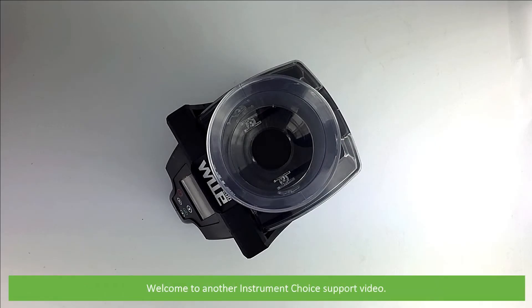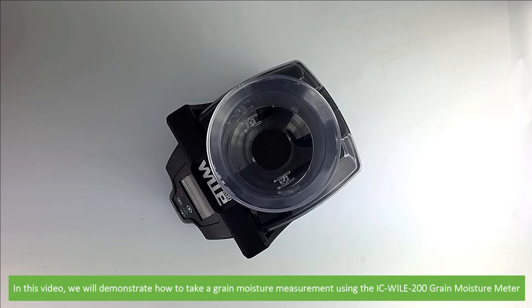Hi and welcome to another Instrument Choice support video. In this video we'll demonstrate how to take a grain moisture measurement using the IC-WILE-200 grain moisture meter.